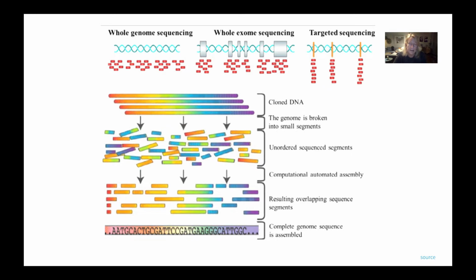And because this is coming in from living material, there is potential for dirt and contamination and all kinds of things to go wrong. So there's many quality checks, depending on what the results will be used for in the pipelines that we support.